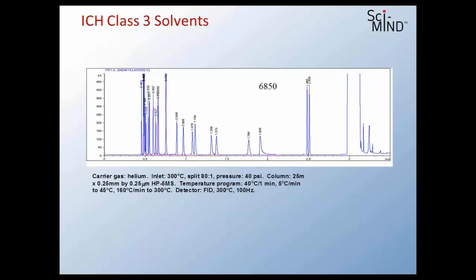Let's take a look at a few more chromatograms. Here's just another group of additional solvents. If I wanted to separate all of the pharmaceutical solvents that are in the compendium, here's another group of those solvents. You can see by this same method they're not separated well at all. So I can go just for speed, but in this case we've kind of sacrificed quite a lot of resolution to do that.